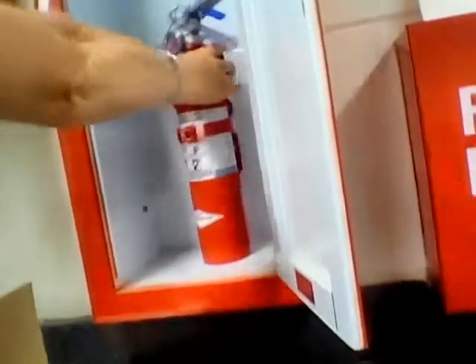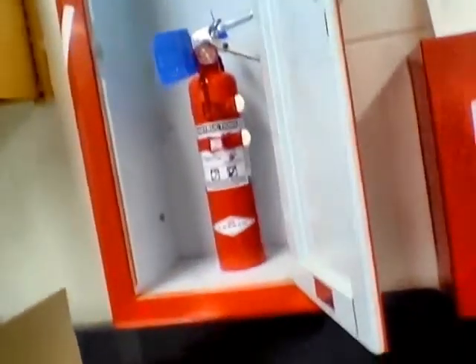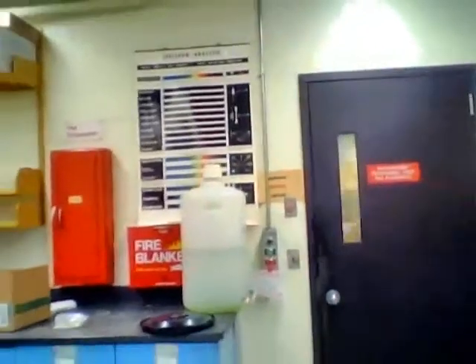We have the fire blanket, back next to the back door here. So we have the fire blanket and the fire extinguisher, which is in here. It's the ABC type, for all the types of fires that we may come in contact with in here. This is the wall farthest away from the door where you enter, looking at the back wall and scanning across. This is just a closet, so don't go in there.